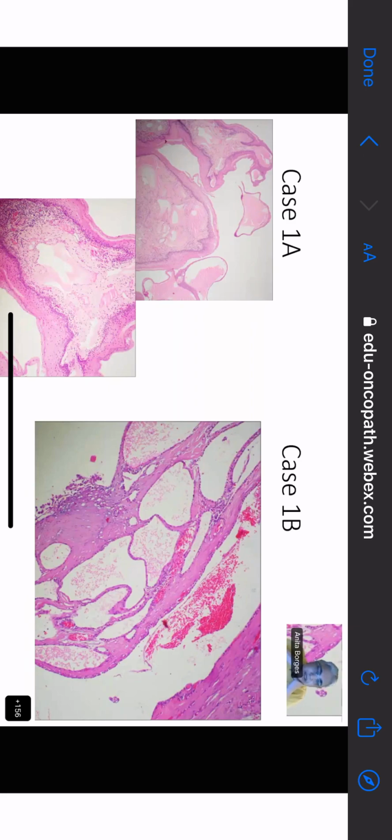And yet, Sweta, you call this a secretion? You agreed that this was a secretion on the left-hand side. No, ma'am. So I think that by now we should realize that secretions are produced. Yes, they are extracellular material produced by an epithelial cell, right? Yes, ma'am. That is what a secretion is.